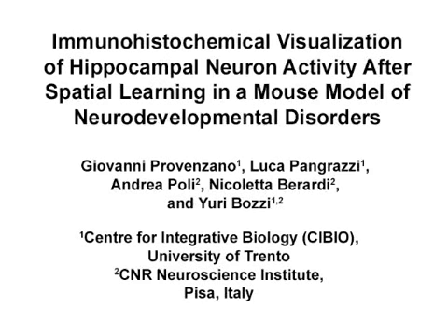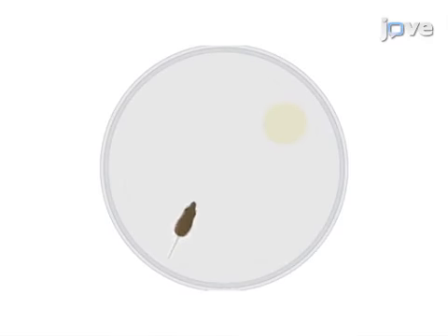The overall goal of the following experiment is to detect changes in hippocampal ERK phosphorylation following spatial learning in engrailed-2 knockout mice as a model of neurodevelopmental disorders. This is achieved by first testing both wild-type and engrailed-2 knockout mice in the Morris water maze.